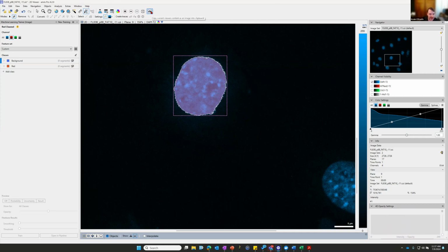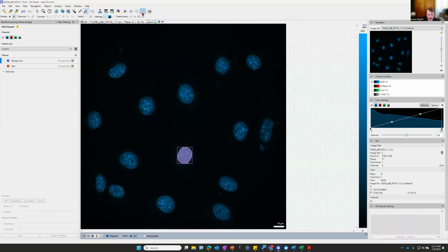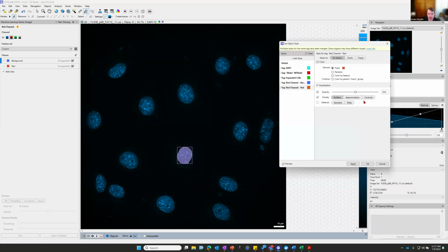Take a screenshot. This is going to take an image of this ROI that we see in here. This button here is going to zoom to fit. So this object in its entirety is going to fit to the ROI that we have in this background here. Zoom in, zoom out.